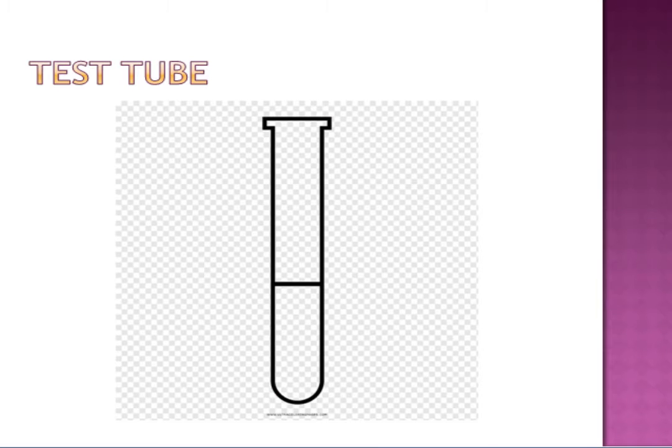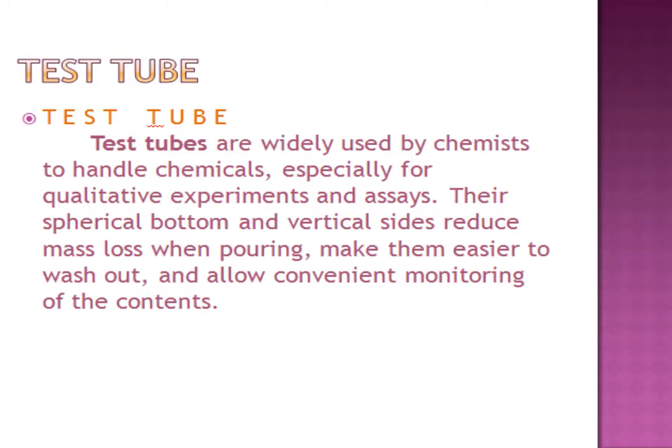The first apparatus for today is a test tube. Let's look at the photo of it to see what it looks like. So like our last video, let's learn the spelling of a test tube before we actually learn about it. T-E-S-T, test. T-U-B-E, tube, test tube.